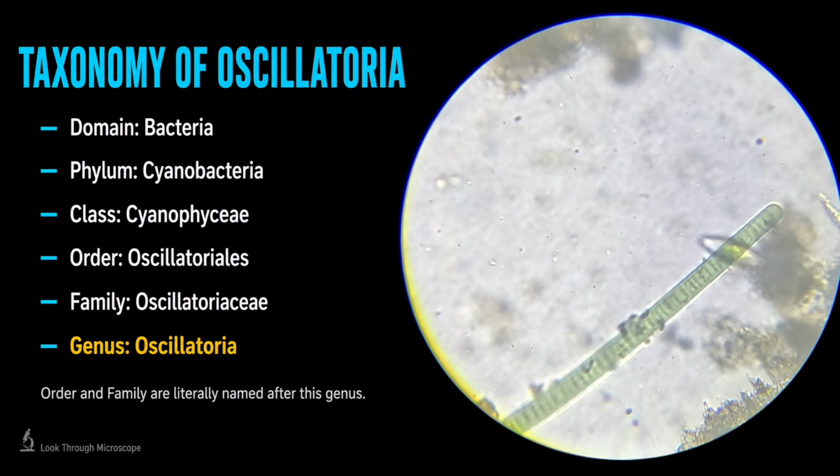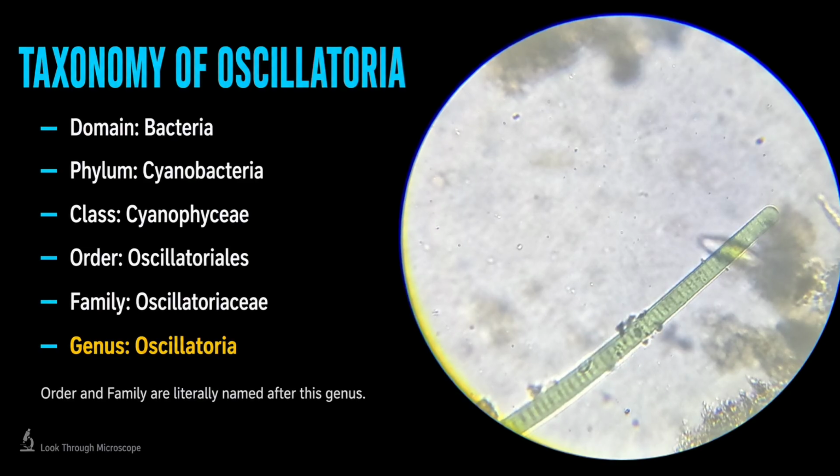Notice something similar? The order and family are literally named after this genus, Oscillatoriales and Oscillatoriaceae. That's how foundational and well studied this organism is. It's not just a member of its group, it practically defines it.